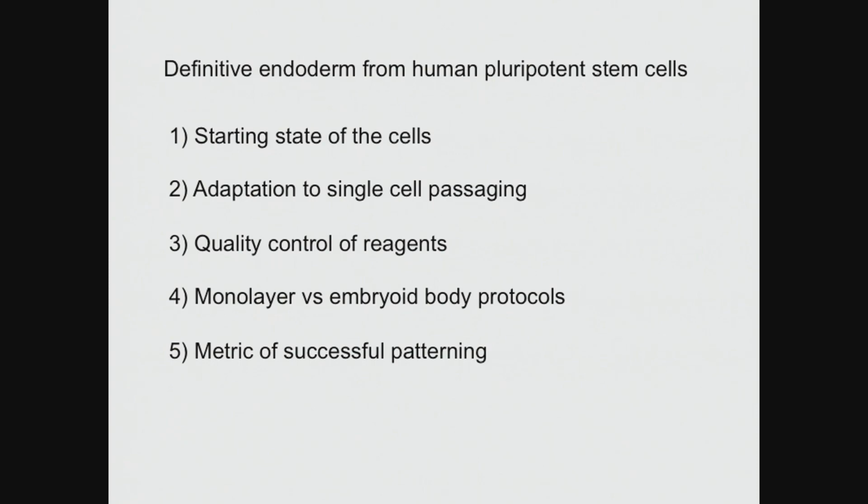So, if you have in the lung protocol, if you're only making 50% endoderm, and then the next step, you lose another 50% efficiency, you can only at best expect that about 25% of your cells could ever become lung competent. And we're getting pretty advanced now, so we're looking at specific, differentiated, mature cell types. We want to get a lot of those cell types. So getting the maximum efficiency at each step is important.